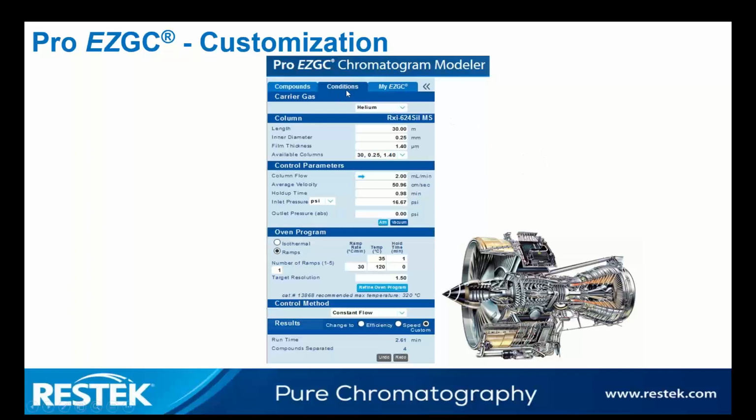So here are the custom conditions that we can click on, and that's the next tab over. We have our solution, and our solution is displayed on the right-hand side. Now we can click on the custom button at the very bottom right-hand corner. That allows you to change whatever you want, basically.